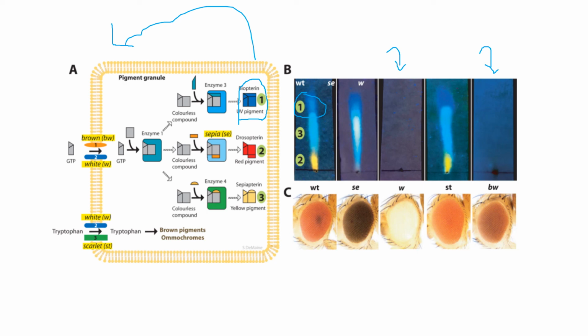And now let me take the red, number 2 here, and you can see it again. It's in the wild type and it's in the scarlet one. But if you see, it's not present here also. So it can tell you more information of where it is supposed to be located. And you can do that with the different mutations and with the different information. Okay?